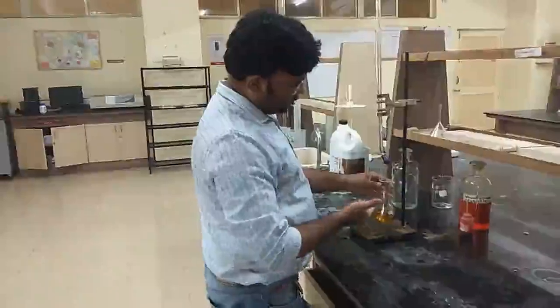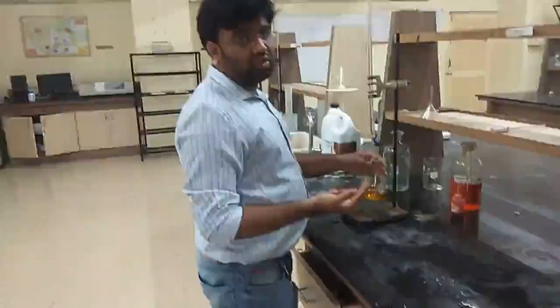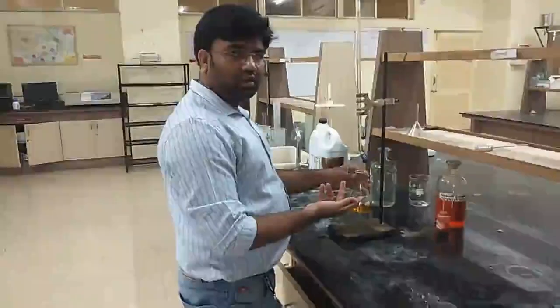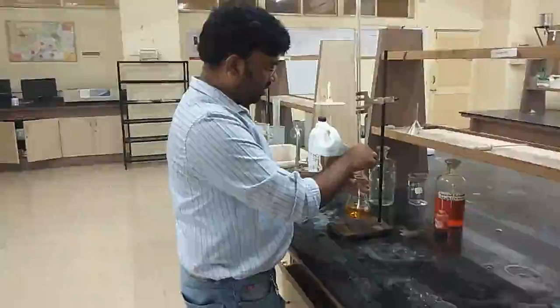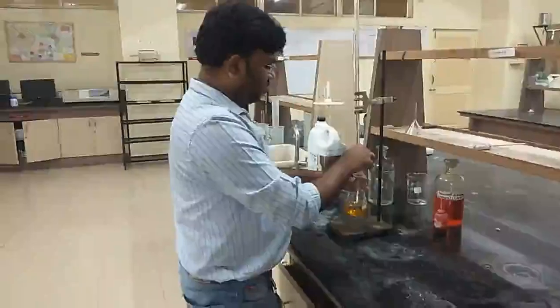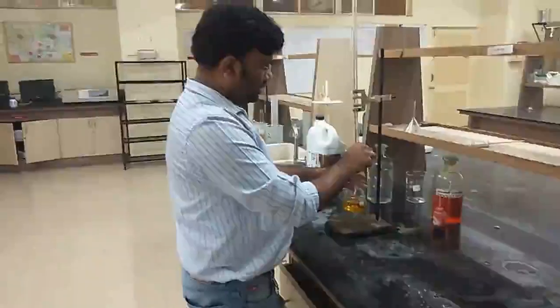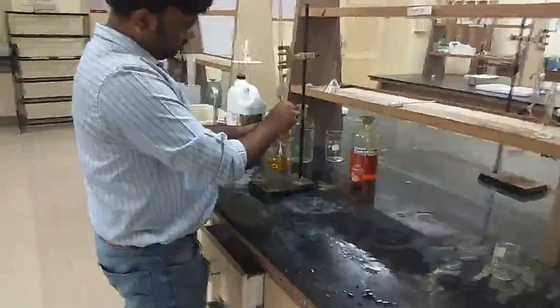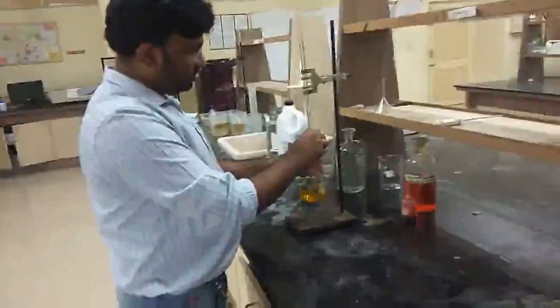As you can see, there is no green color that is obtained, right? If there would have been green color development, it would have been a failure. But here no green color development immediately after COD digestion has occurred. So let's start with the titration part and observe the color change.